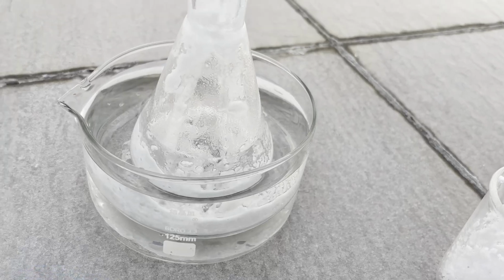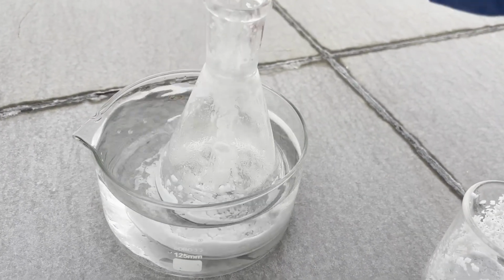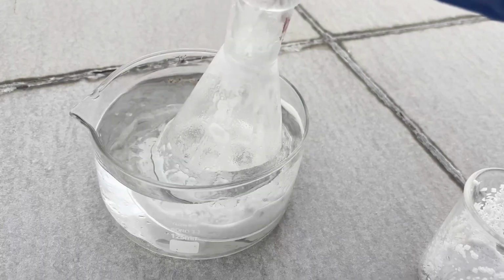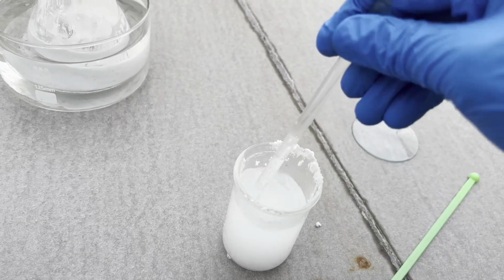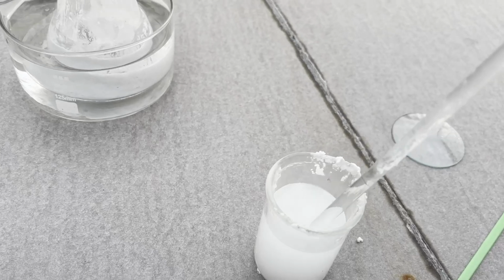I took the lesson and used a water bath to cool the flask down, and continued adding the rest of the potassium hydroxide. When all of it is added, some ethanol is added to the beaker and then poured into the flask to dissolve the hydrazine from the insoluble potassium sulfate.